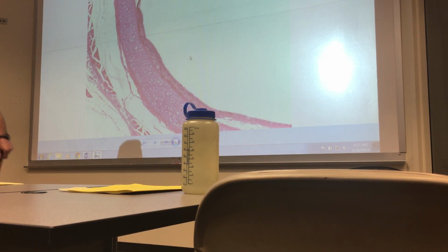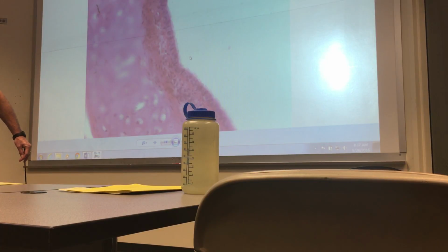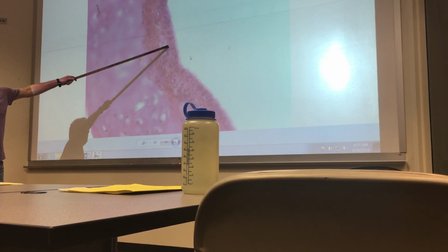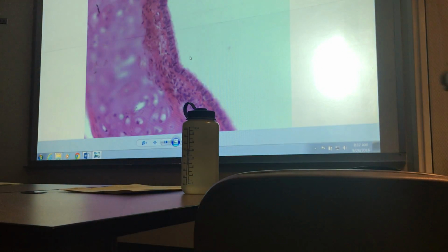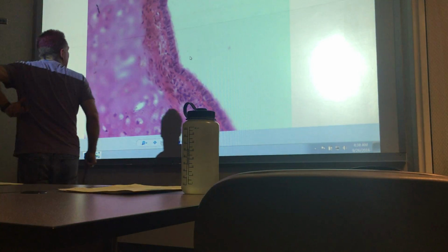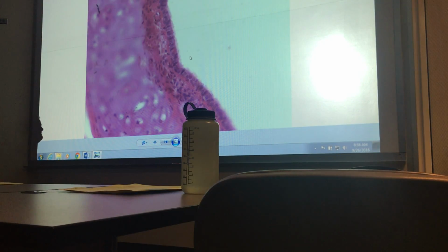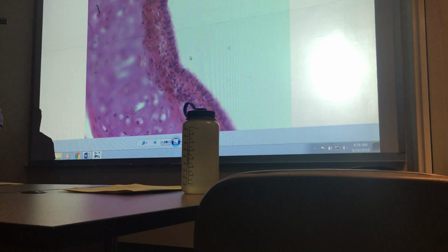and is this the one where on the video I just get so sick of saying pseudostratified, ad nauseam? And there we can actually make out the cilia fairly clearly. They're a lot clearer on your computer than they are right here. This thing never seems to be perfectly in focus. What are the three types of cells found in this tissue? Goblet cells, basal cells, and the ciliated columnar cells.